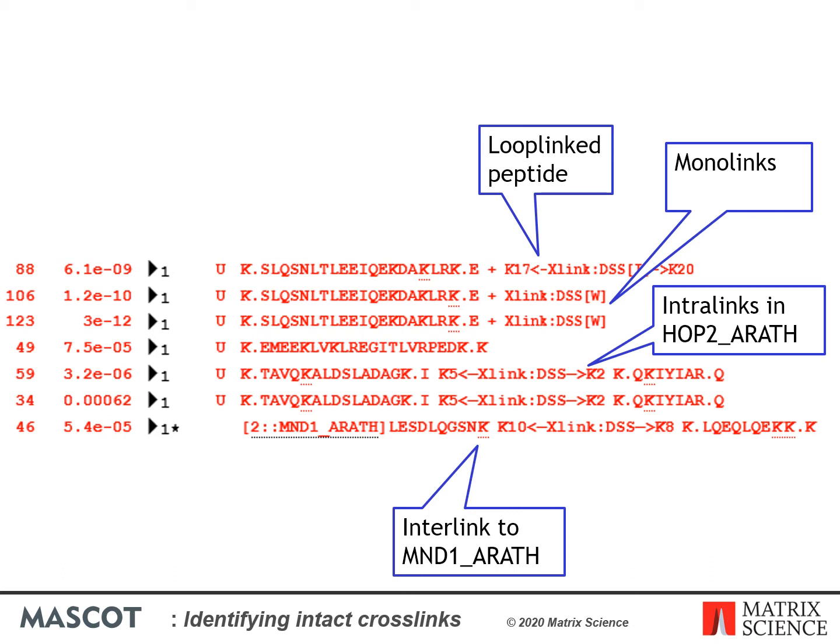The scores for all the matches are standard Mascot scores, and the identity and homology thresholds are calculated using the same statistical model as for linear peptide matches.